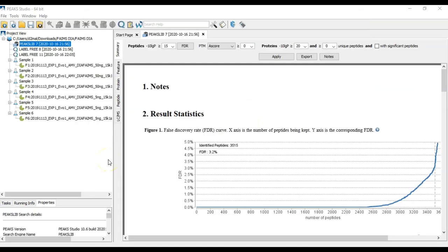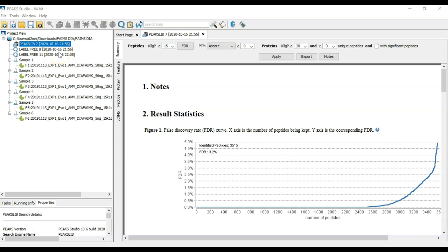Once the search is done, you'll end up with a project tree that looks something like this. In it, you'll have your library search results and some quantification results. Just to give some background on this experiment, this is just a subset of a larger DIA FAIMS experiment.